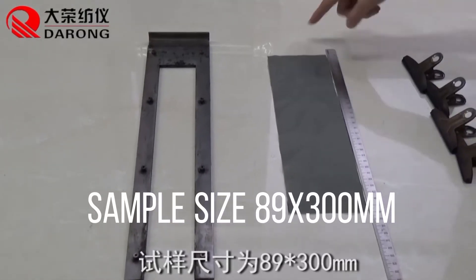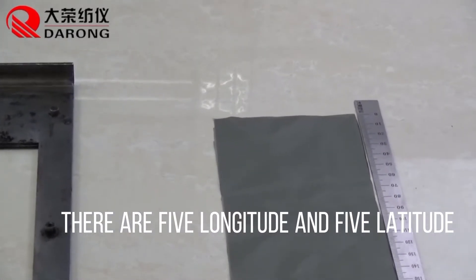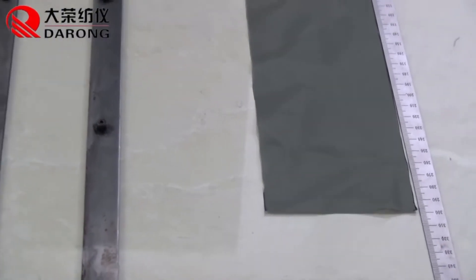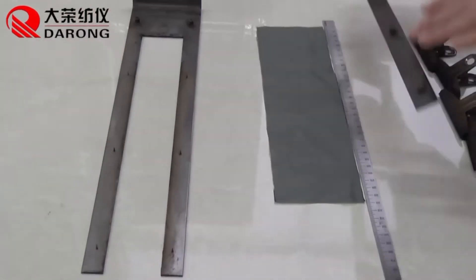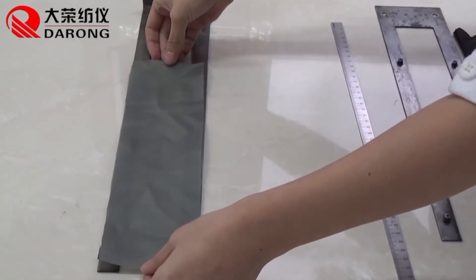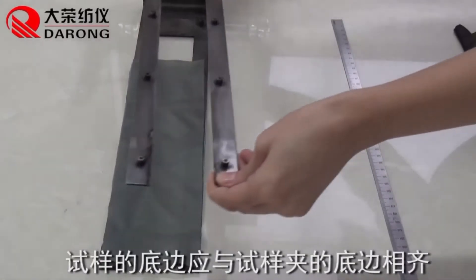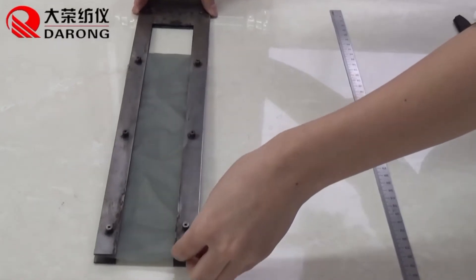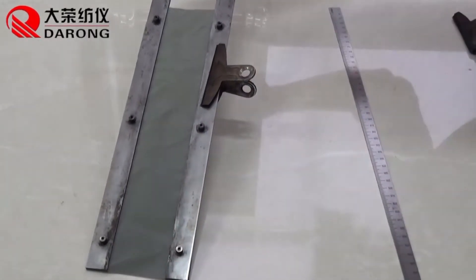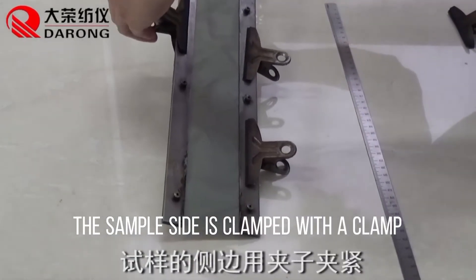Sample size is 89 by 300 millimeters. There are five longitude and five latitude samples. Install the sample in the sample holder. The bottom edge of the sample should be lined with the bottom edge of the sample clip. The sample side is clamped with the clamp.